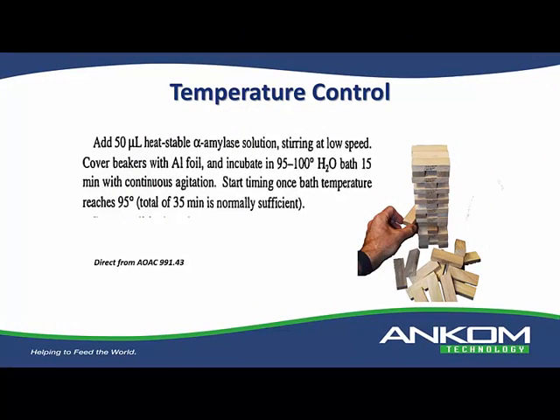From a temperature control standpoint, this can be largely sample dependent, but it's also an important factor for the enzyme's best operating temperature. There's also a pH factor for the different enzymes. In method 991.43, the amylase digestion — the first digestion — calls for 95 to 100 degrees for at least 15 minutes. I had a laboratory in another country which mistranslated that to say it had to be 95 to 100 degrees for 35 minutes. That's not what the method says, and so they got an impact on their results.